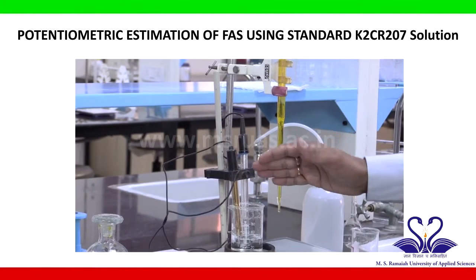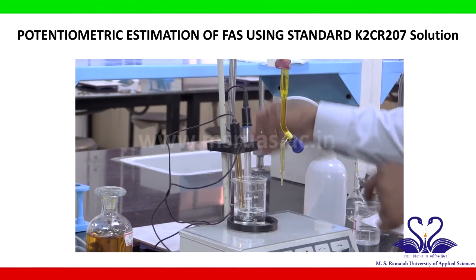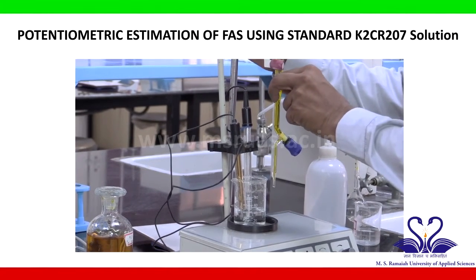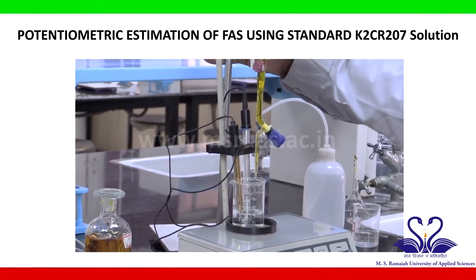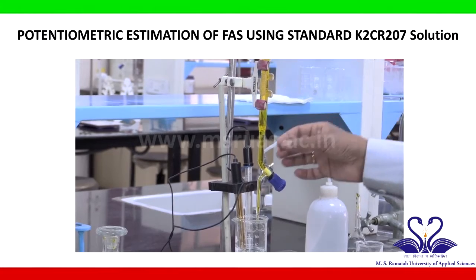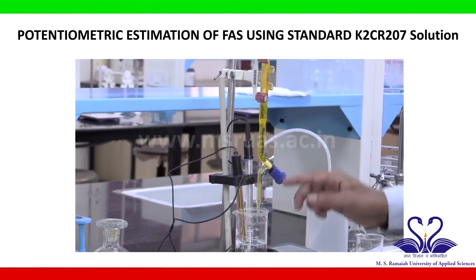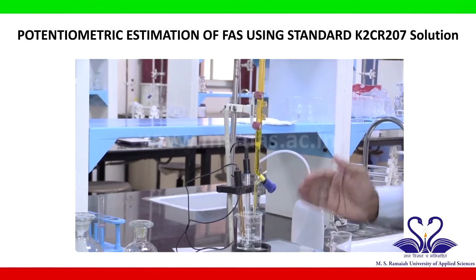Now we have placed the electrodes into the solution. Adjust the position of the burette exactly over the beaker. Now let us start the experiment.